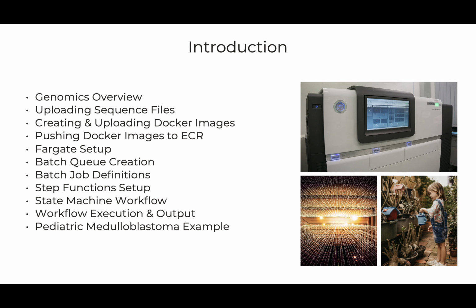Our focus will be on the intriguing realm of genomics secondary analysis, a critical process that helps us make sense of raw genomic data by aligning it with a reference genome and pinpointing variants. We'll be navigating the robust infrastructure of Amazon Web Services, or AWS. We'll work with sequenced reference and patient genomes, which are stored as fastq.gz files. These files will be uploaded into an AWS S3 Bucket, setting the stage for our analysis.